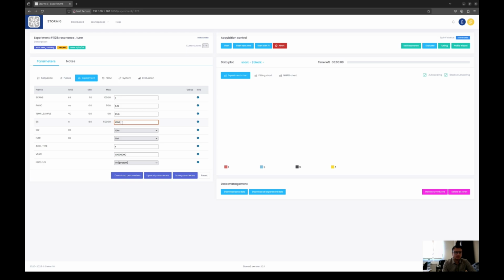And this tells us how many points there are in our FID. By default it is 1000, but we can increase and decrease it. Then this is also the sweep width, which is basically related to the sampling frequency, how quick or how slow we want to sample our signal.